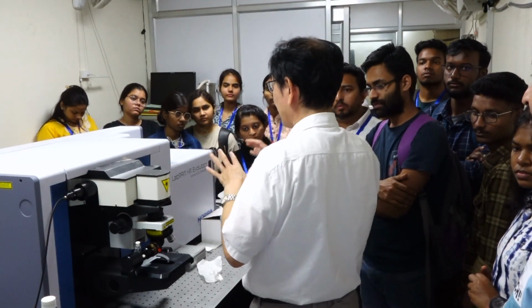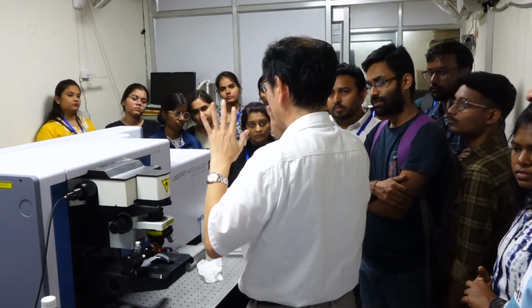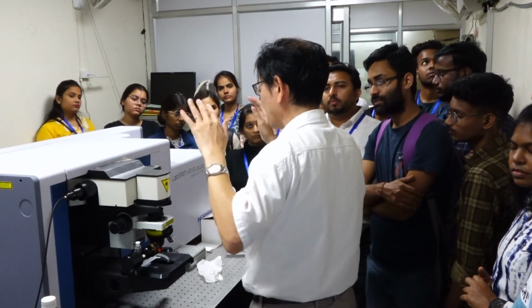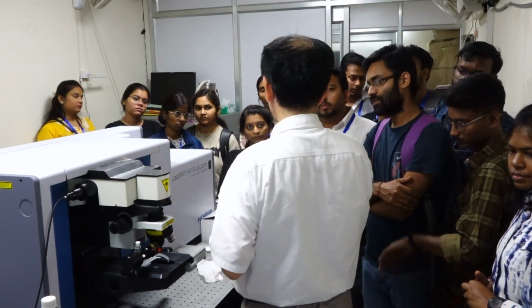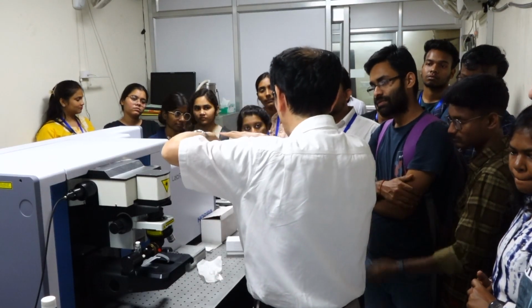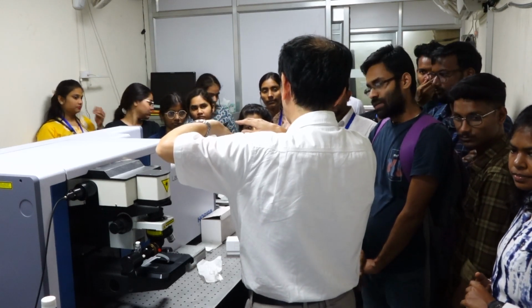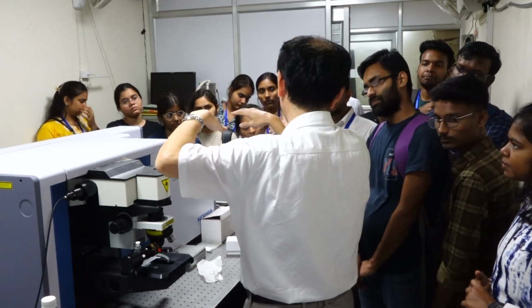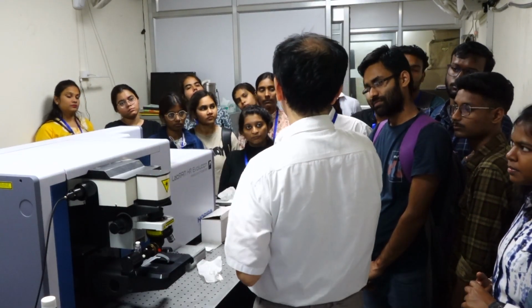By turning off and shutting out all the stray light, and doing the experiment carefully, the baseline becomes lower and lower. And ideally it should be flat. But that's it.